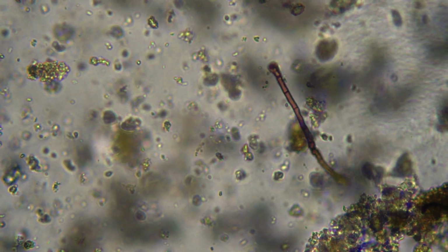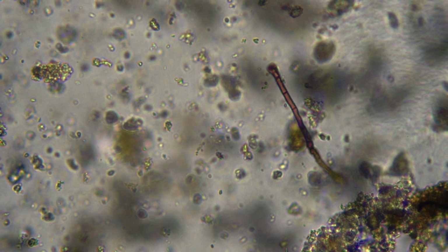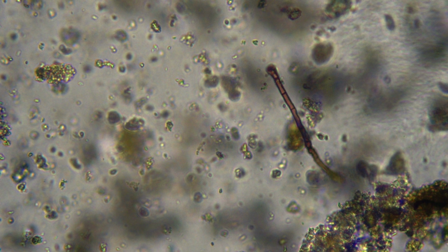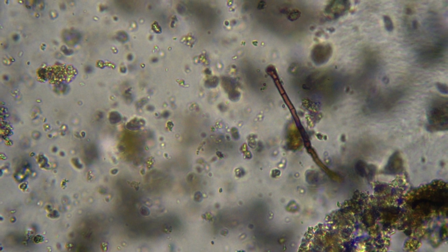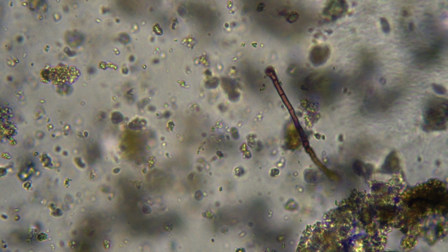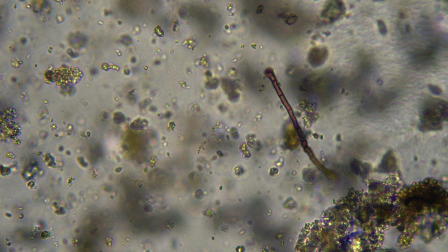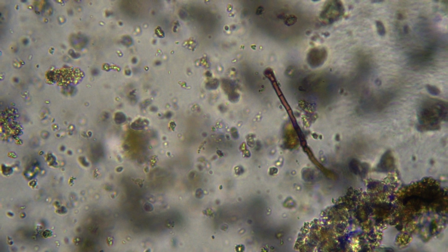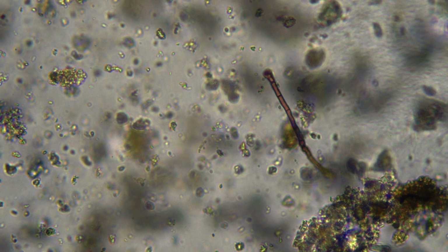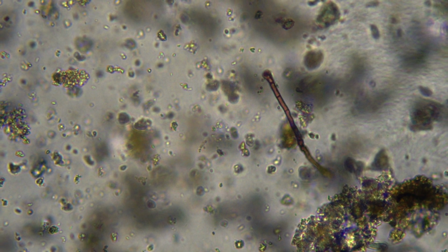And here it is. This image shows a few things actually. I suppose what sticks out most obviously is the strand of fungi. And the reason I particularly like this image is also next to the fungi is quite a large chunk of organic matter. The fungi itself is a beautiful nut brownish hue, which means it's probably going to be a beneficial fungi.